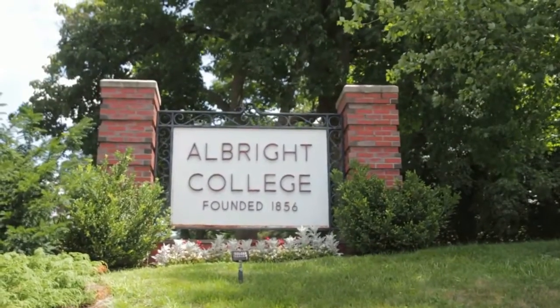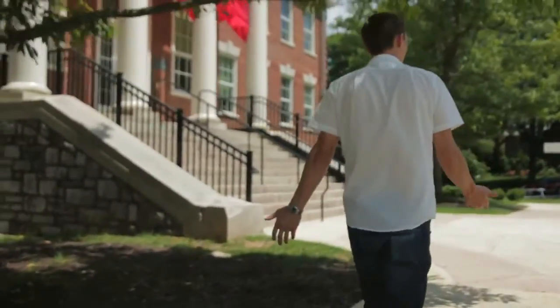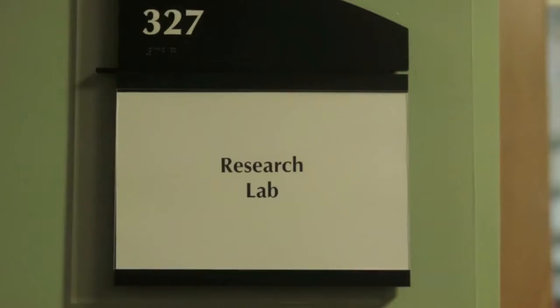My name is Matthew Sontag. I'm an assistant professor in the Department of Chemistry and Biochemistry, technically a physical chemist, and I just finished my first year here at Albright College.